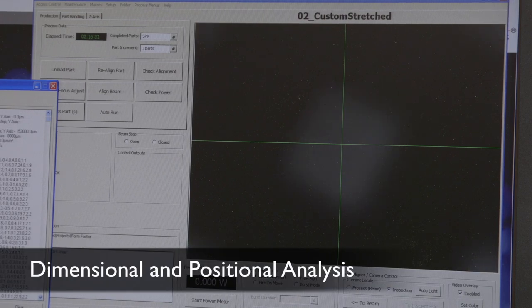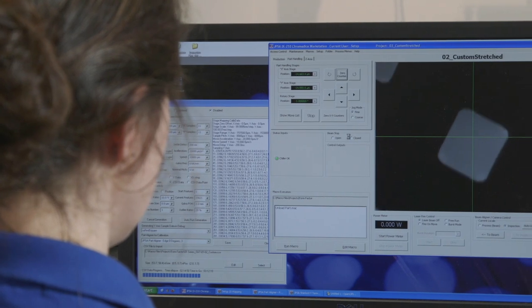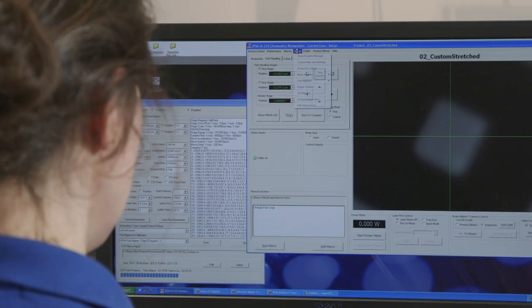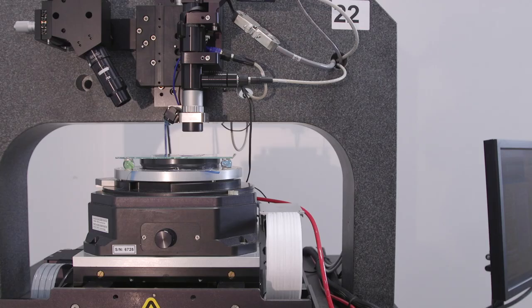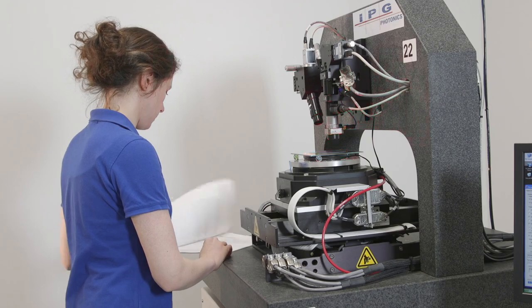We are currently inspecting microvias that were drilled in a silicon nitride ceramic with an IPG custom inspection tool. This is built on one of our IX series platforms. We are inspecting for positional accuracy as well as the height and width of our rectangular microvias.